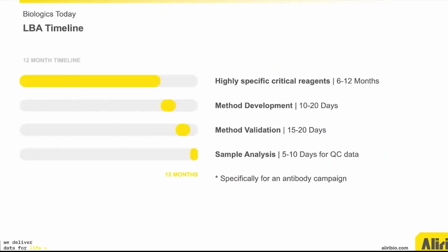This slide shows the typical timing for developing, validating, and performing sample analysis with an LBA methodology. Creating high-quality reagents is a time-consuming step during the pathway and can lead to delay of critical go, no-go decisions along the drug development pathway.